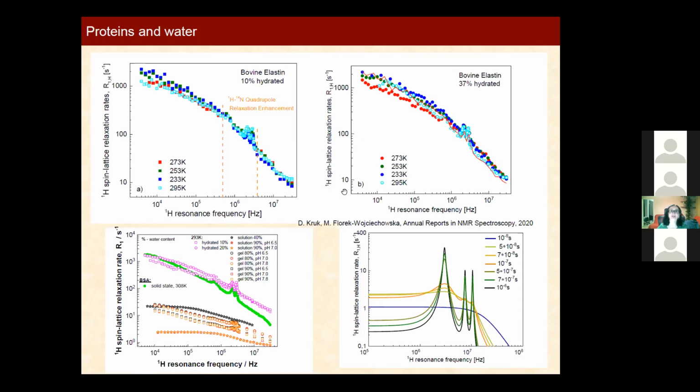But for instance, there is a fast component and a slow component. And actually, I don't know if the experiment was set like that, that one measured just only the slow component. There is nothing wrong in that. But I think that somehow it shows us that maybe it's not true that in solutions one can measure only water. That maybe one could really catch also the macromolecular contribution.